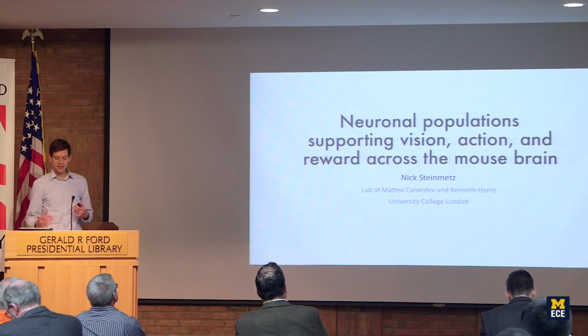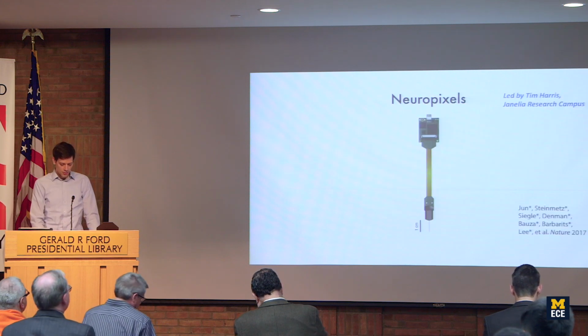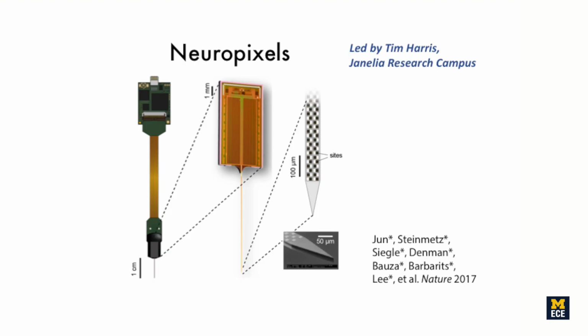So I'm going to talk about this topic, but I want to do a little bit of a detour first into something that's a little bit of a technical issue, but I think will be of great interest to a lot of people here at this conference in particular. So the work I'm going to show you is data collected with Neuropixels electrode arrays. You've heard about these at previous ICANs if you were here.